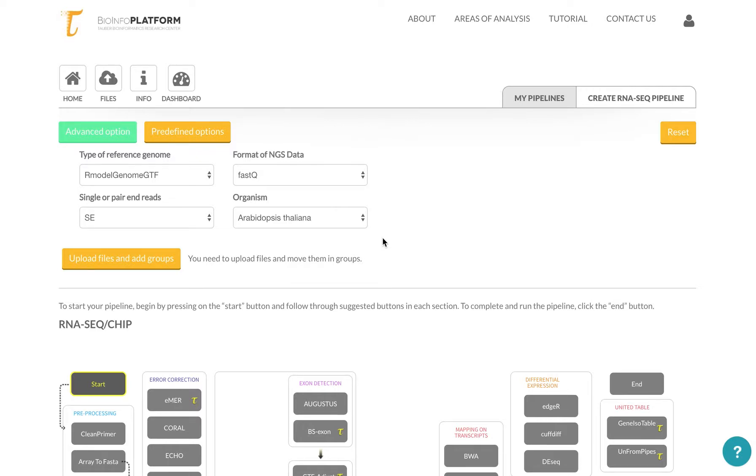The transcriptomics section is designed in a way that you can start using the pipeline very quickly right after you upload the data.